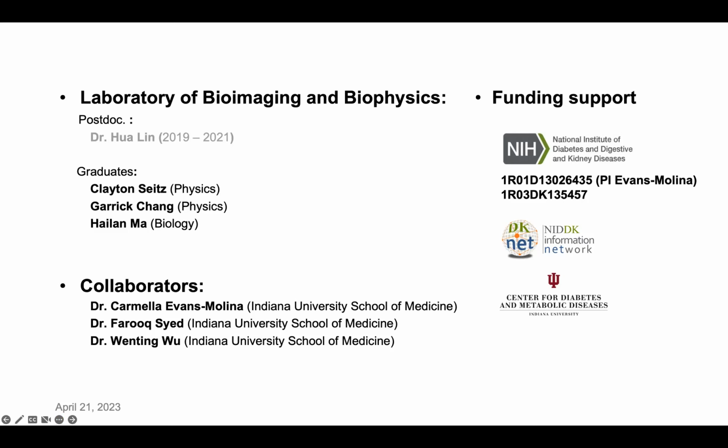Thank you for Dr. Jin Liu's great presentation. So now is our Q&A session. During your presentation, I think there's one question from the chat. It's from Dr. Klaus Kaisner. In the chat, it said you showed how Segment Anything could segment nuclei, but you didn't explain how you segmented cells, as you did not include a plasma membrane marker. Did you just employ a watershed model?